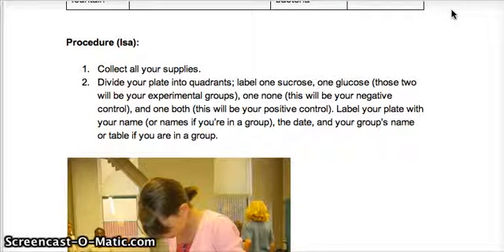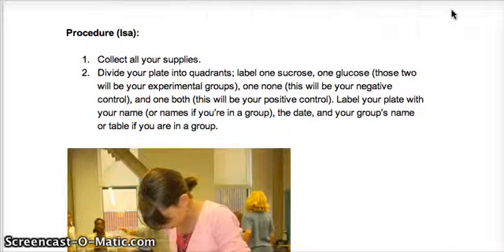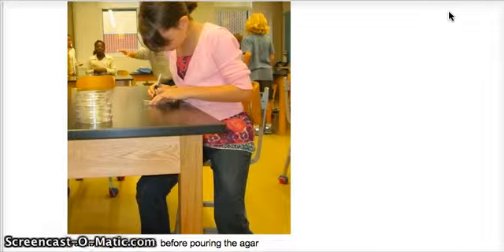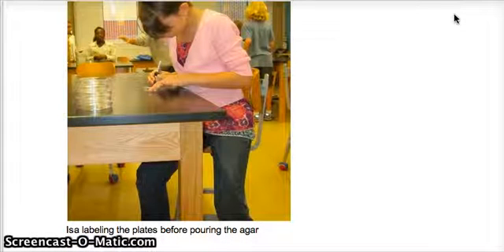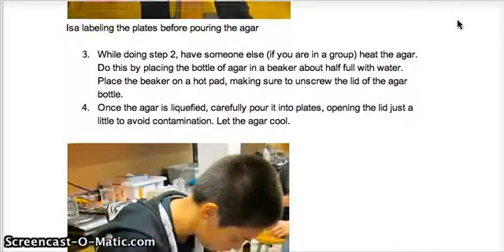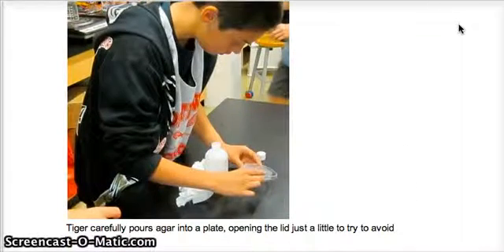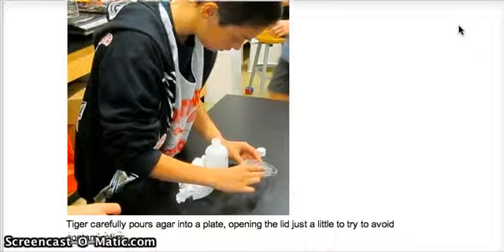This is step-by-step instructions on how to do the experiment. And we have some pictures in here. This is me labeling the plates before pouring the agar. And this is Tiger, and he's pouring the agar. He's opening the lid just a tiny bit to try to avoid contamination.